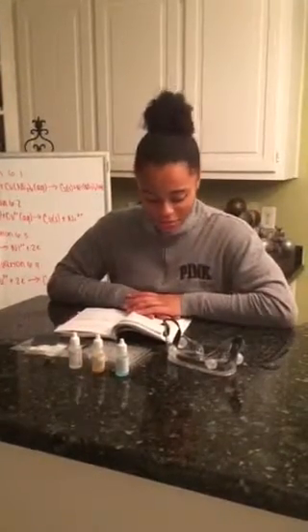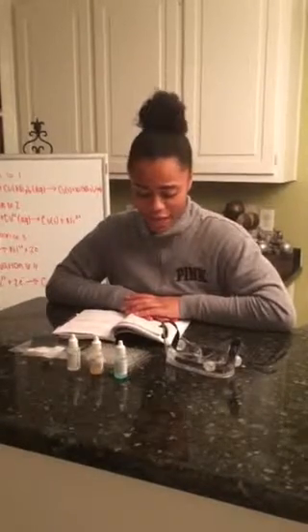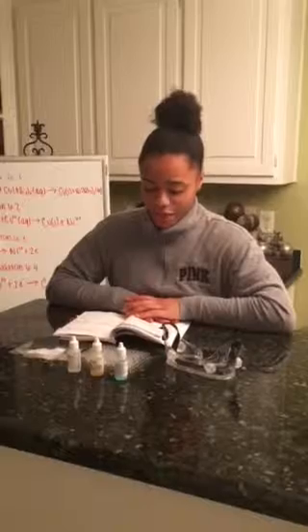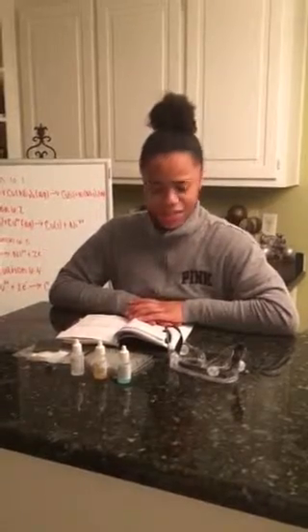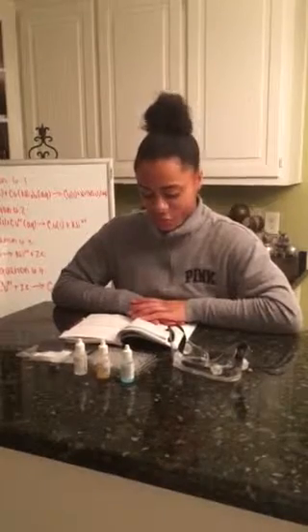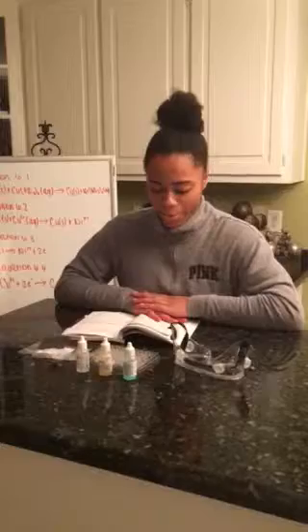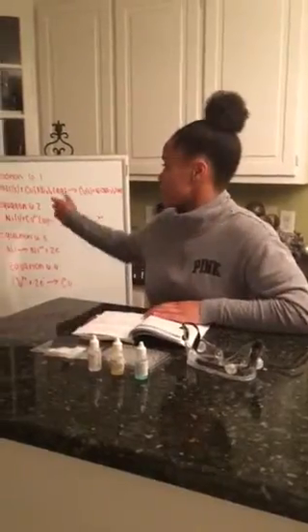The background of this experiment is single replacement reactions are a common type of chemical reaction. In the case of metals, a more reactive metal will replace a less reactive metal. For example, elemental nickel will oxidize and force copper ions to reduce to form elemental copper. One equation for this is equation 6.1.